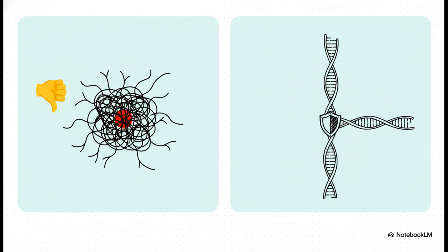The fix was the phosphotriester method you see on the right, and the breakthrough was so simple, yet so brilliant. They just added another protecting group to that trouble-making phosphate. That one little change stopped all the branching, cleaned up the reaction, and gave scientists their first truly reliable way to build short DNA strands.